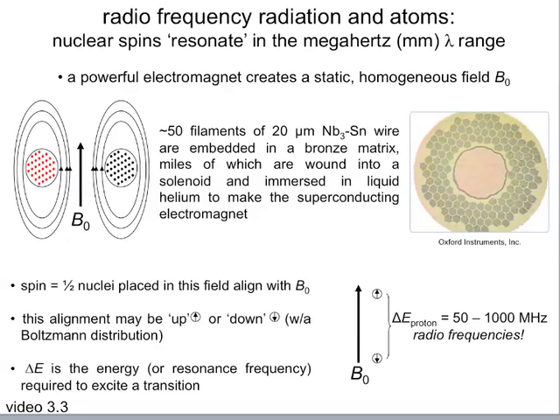It's beyond our range to go into that today, but suffice it to say that there's enough of a difference. We're not equally up and down, but there's enough of a difference for us to detect. There's a separation of those two spins, and that separation amounts to an energy. And that's the energy that we're interrogating when we hit the spins with that radio frequency radiation. So it just happens to be convenient that we can identify those spins based on their response to radio frequency radiation.